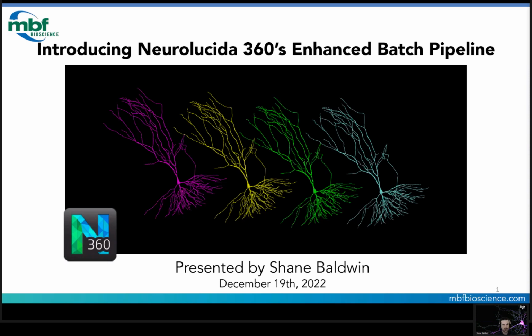So along with our batch pipeline, we're excited to announce that the newest release of Neurolucida 360 was released on Friday, December 9th. So I hope some of you already have some experience in the new release. We're super excited about it and super proud of it. So let's get started.